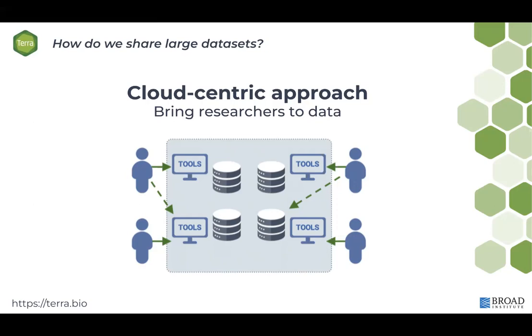You only pay for a single storage instance, whatever you need access to. You get shareable tools and containers that make your results and your analyses much more reproducible. And you get cost-effective and elastic compute resources.